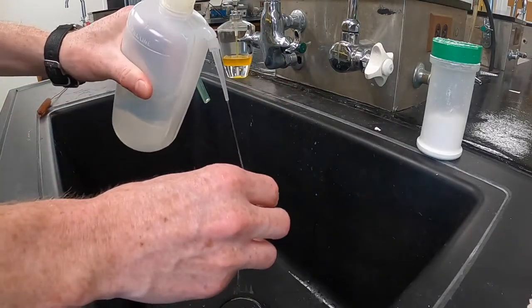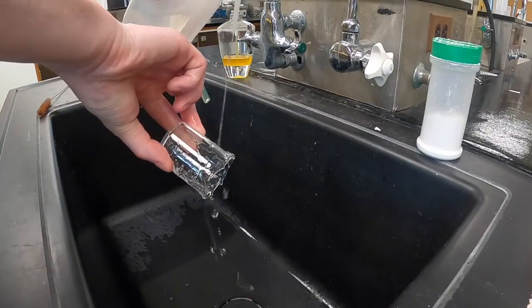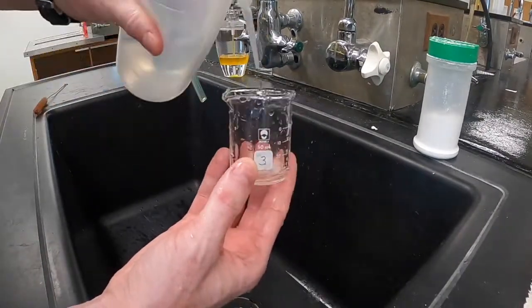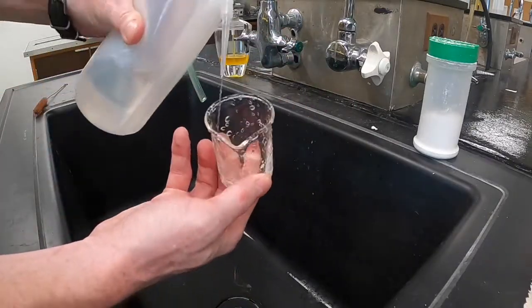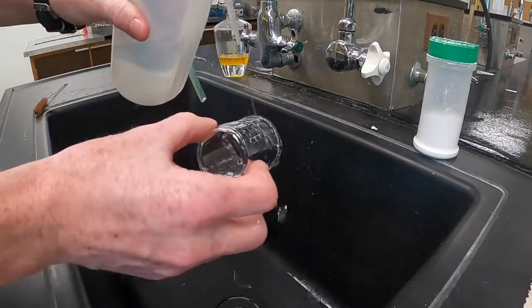The distilled water rinsing step really isn't for cleaning — it's more for removing any traces of tap water. The reason you need to remove the tap water is because tap water often contains dissolved impurities, and when it dries, those impurities will be left in the glassware. The distilled water, because it's had all of its impurities removed, can be used to get rid of the tap water.